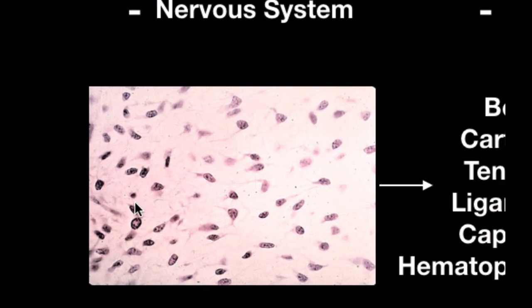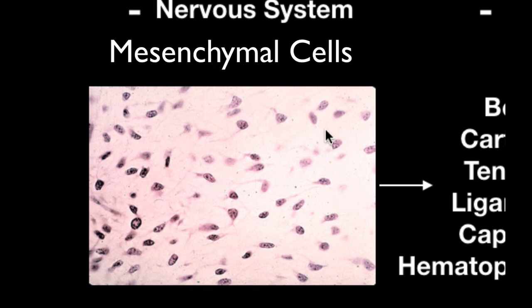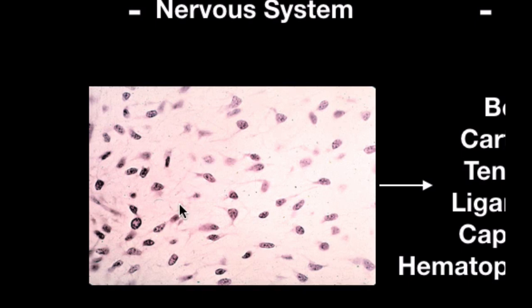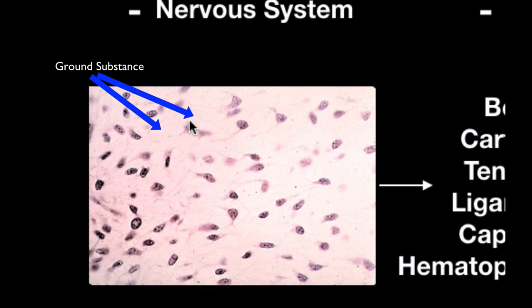If we zoom in on that picture, you'll see different nuclei — all those dark spots are nuclei, and all those cells are called mesenchymal cells. When you look at them under the microscope, mesenchyme has cell processes that form a network with each other. That network is called the syncytium. You can also see what we call a ground substance between the cells — it's not going to be empty space.